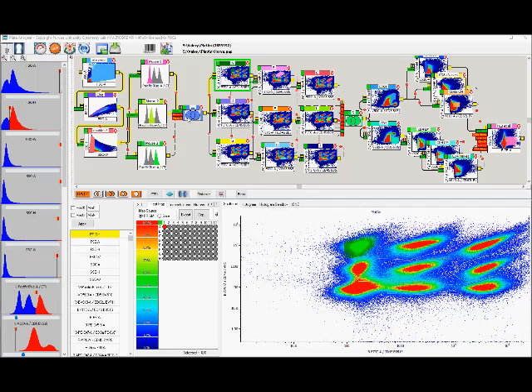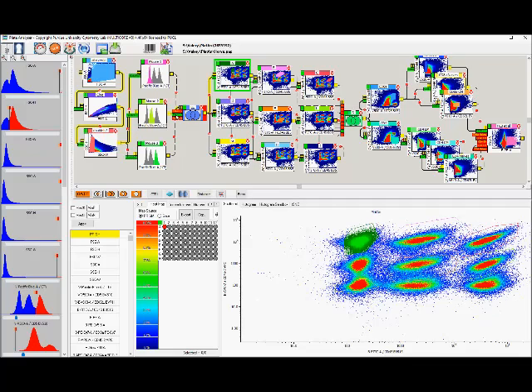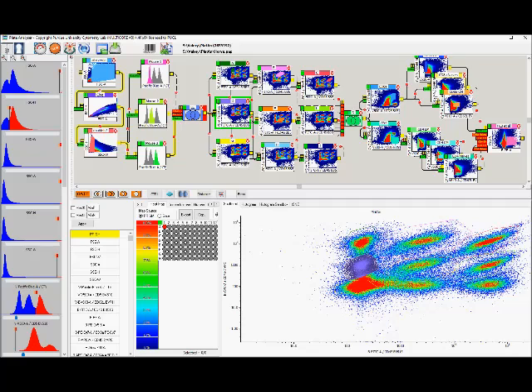Okay, now we'll show you the Boolean operators. So you can see I can select mouse 1, mouse 2, or mouse 3. So if I right-click on a population, so this is one of your barcodes, you'll see here, this is the green one. If I now go into the top left, I can make this modal, which means that only mouse 1 will be shown in here. Or if I click mouse 2, this is mouse 2, this is mouse 3 with this one. If I were to move to this one by right-clicking, I would get the same information, mouse 1, mouse 2, mouse 3.